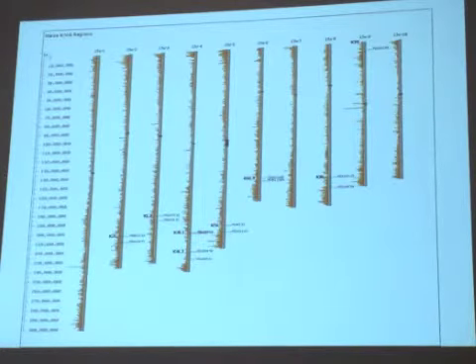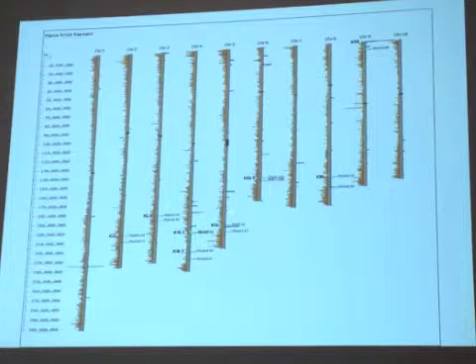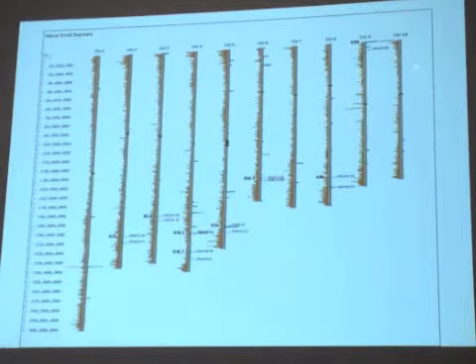And the knobs are characteristic, so we painted one of those knob repeats onto this picture, and we were thrilled to find this is the inbred line called B73 that was used to do the reference genome. And the B73 knob is right here, and here we found the repeat. And it has another one up here, and again we found the repeats in there. So this allowed us to do some data mining and helped us reduce the regions where we expect the knobs may be found.